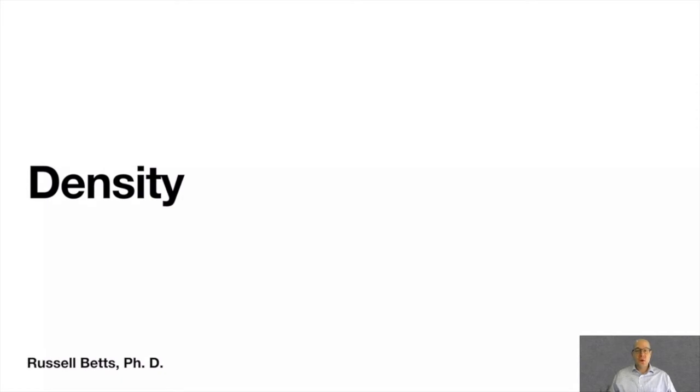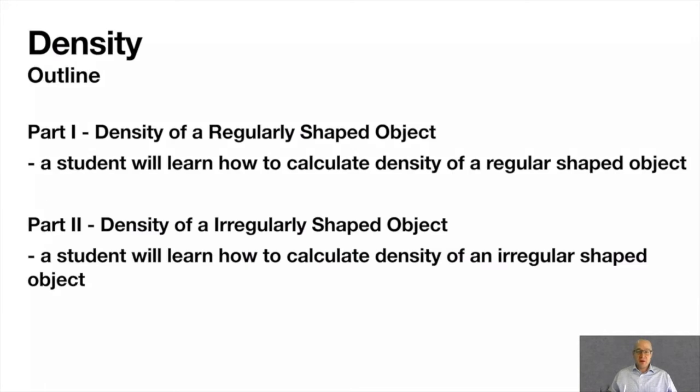This is Unit 4, Density. Density is mass over volume. So we're going to learn a few different techniques to determine the mass and the volume of different objects and determine their density. Very fun lab, very simple to do, but very fundamental.